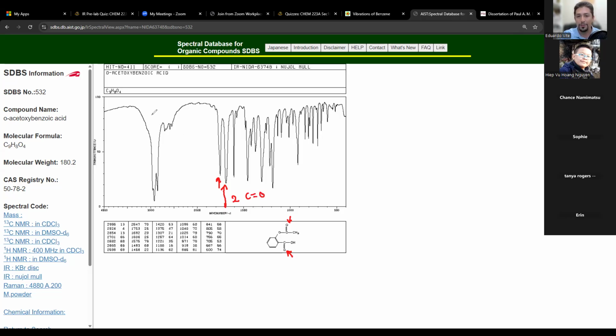And then, of course, this would be the carboxylic acid OH. This would be sp3. This might be some sp2 somewhere in here, but it's being blocked by the OH, so we don't even get to see it. You see? And we have an aromatic ring. So again, this is probably your carbon double bond carbon right there. I accidentally wrote an oxygen. Carbon double bond carbon right there. So again, the rest is up to you.